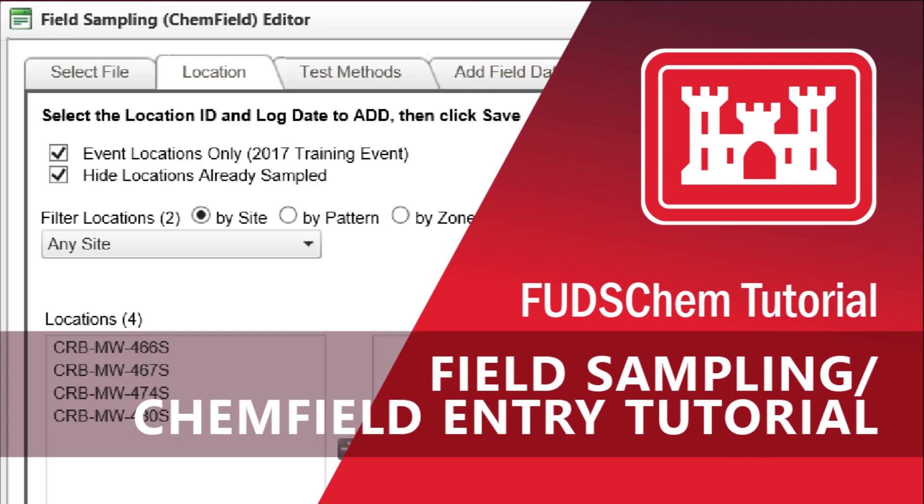This video will go over how to enter CHEM field files in FUDsChem. CHEM field files are digitized versions of the Chains of Custody, or CoCs, and are used to ensure completeness of lab deliverables later on. It is important to enter this information soon after sampling to prevent delays with lab data submission.